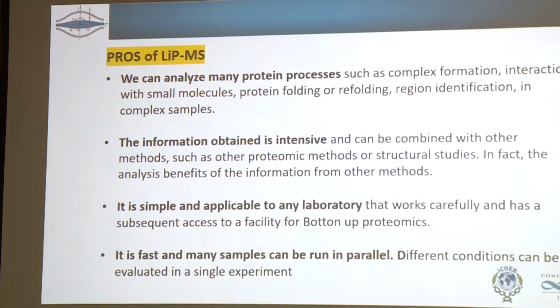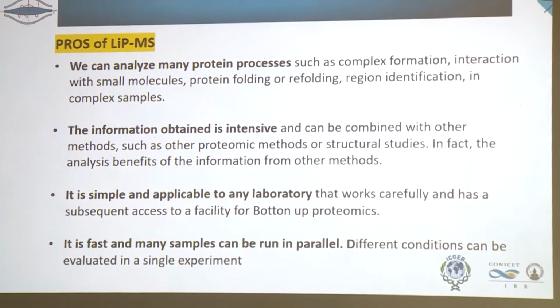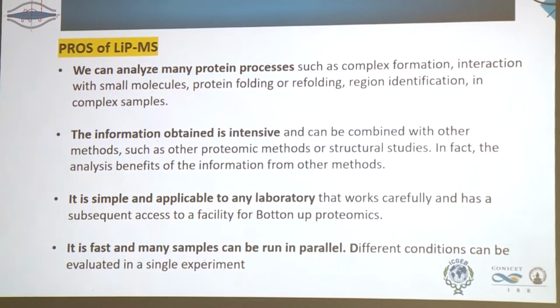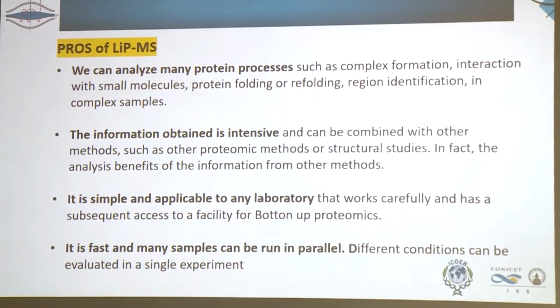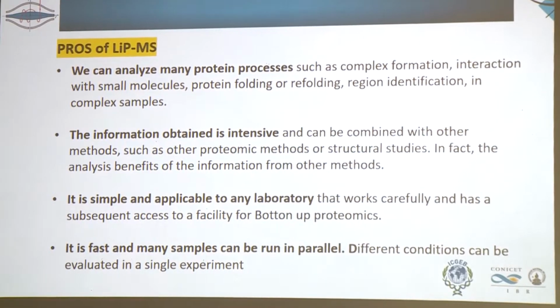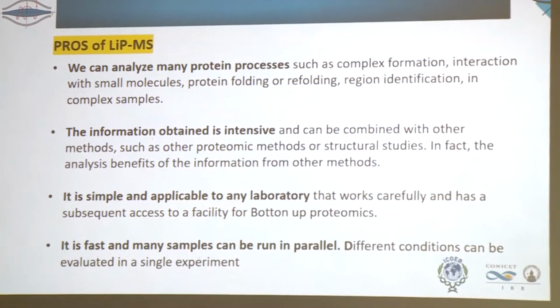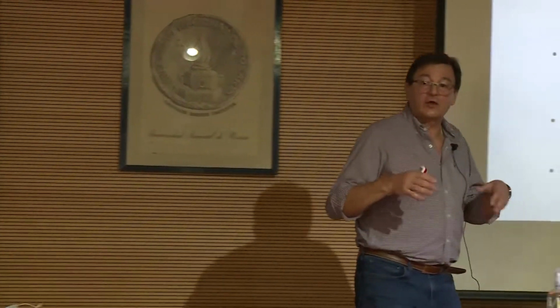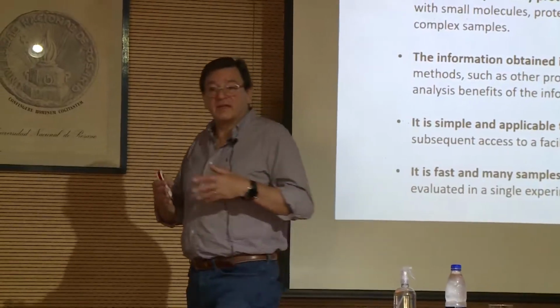Well, so what are the pros of the process? If you run a proper LiP-MS experiment, you will have a lot of data. So you will have to sit down, think and analyze, because you will have hundreds of proteins affected in a complex sample by this process.